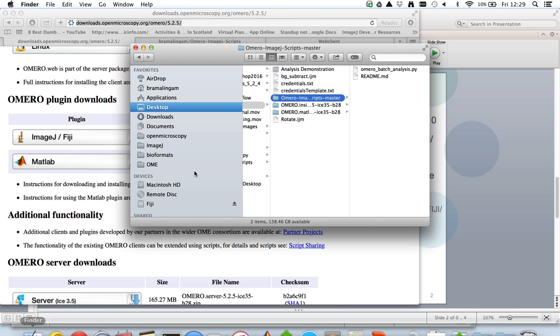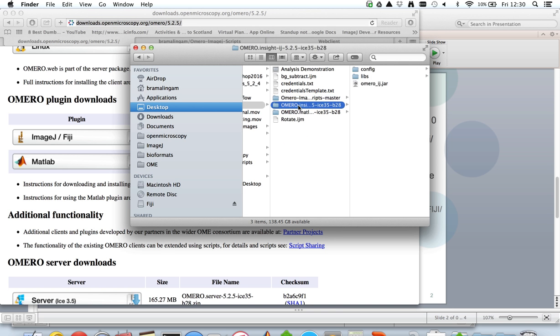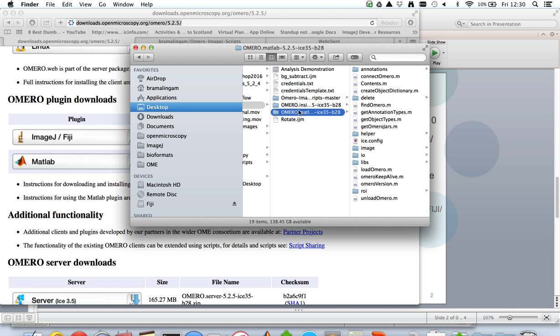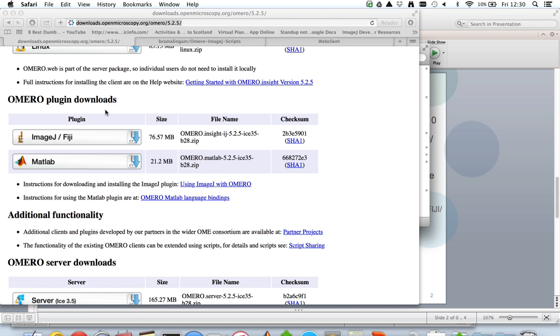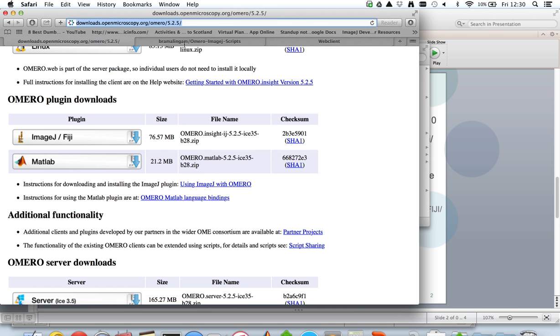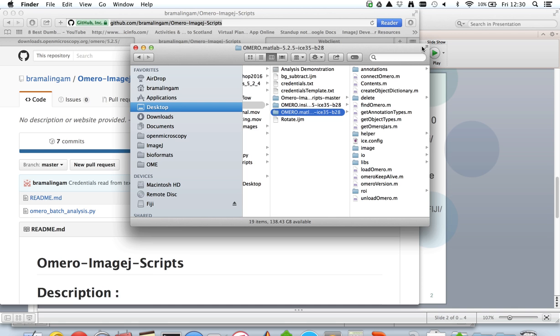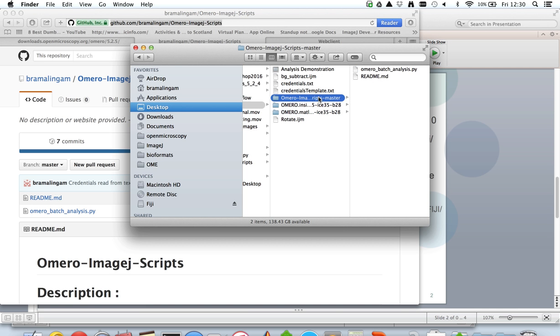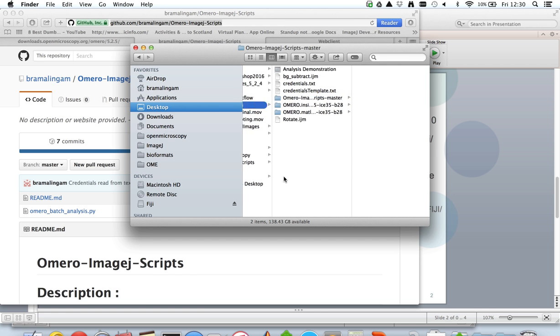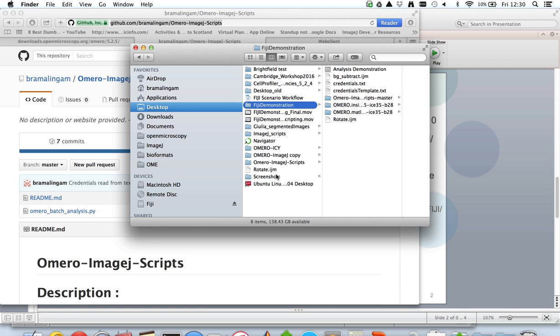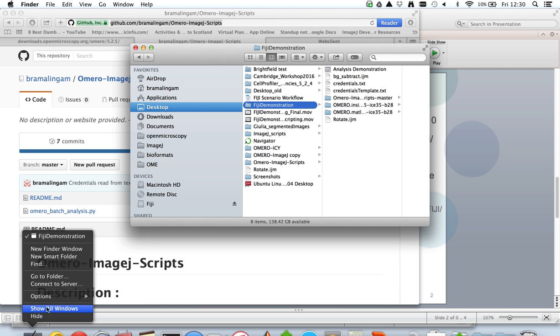For demonstration purposes I've already downloaded them locally: OMERO Insight ImageJ plugin and OMERO MATLAB toolbox. The example script that I'll be running during this demonstration is also under my GitHub repository and I've downloaded that as well locally in OMERO-ImageJ-Scripts. So let's start with the actual setup process.